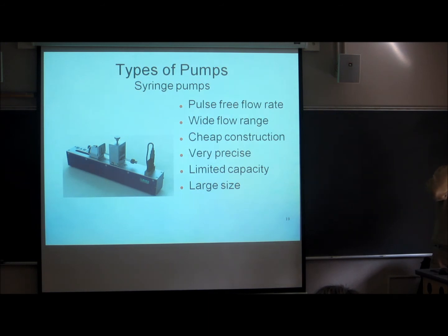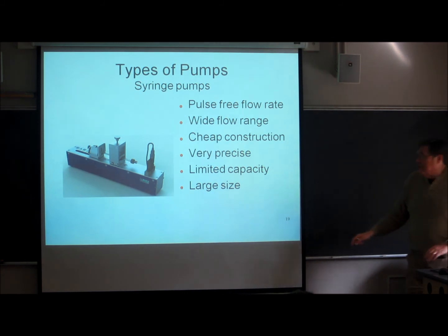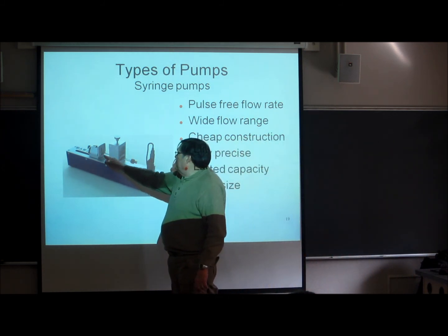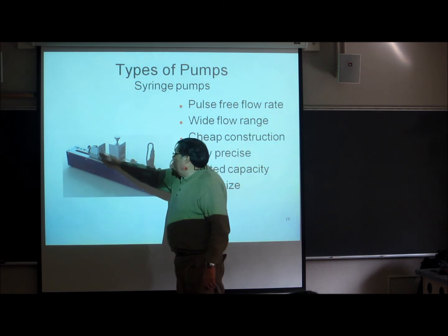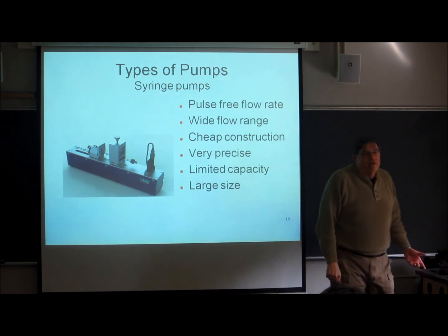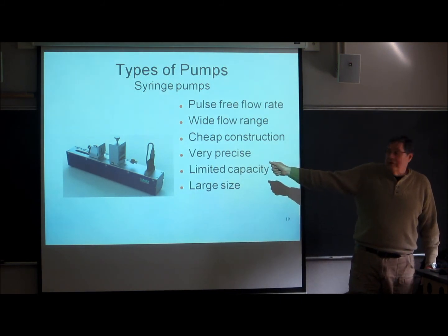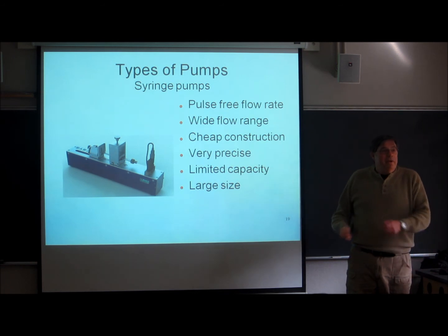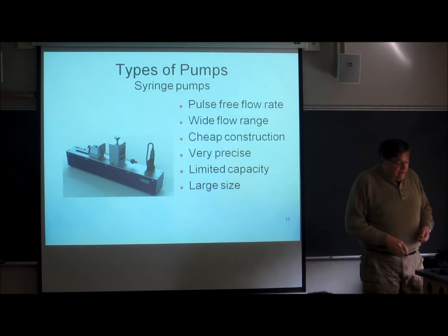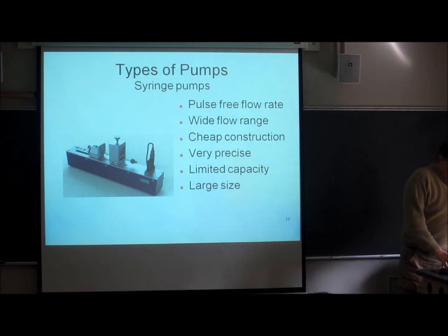This is a syringe pump. These are beautifully free of pressure changes. It's a nice linear motion. And you can drive this with a motor and a screw, fill up the syringe, and then push the needle in with the motor, and that pushes it into the stationary phase. There's a limit there because you have to refill it. So if you get 10 mils of solvent through that, you've got to stop the experiment, refill it, and then start it again. But for short-term experiments, it works very, very well, and it's not subject to pressure glitches. It's very precise, too.